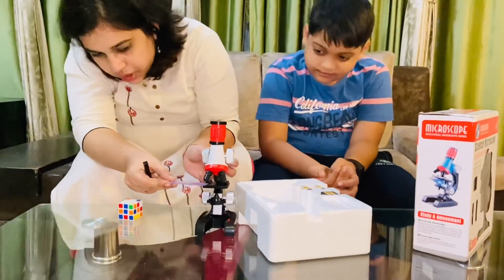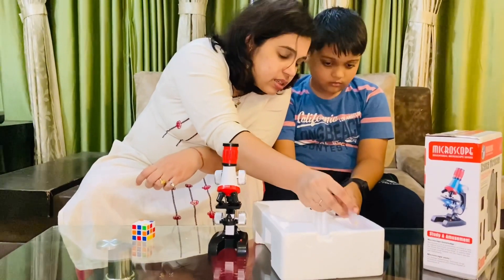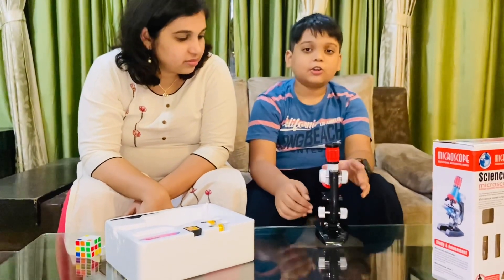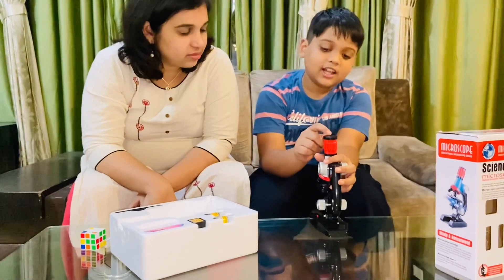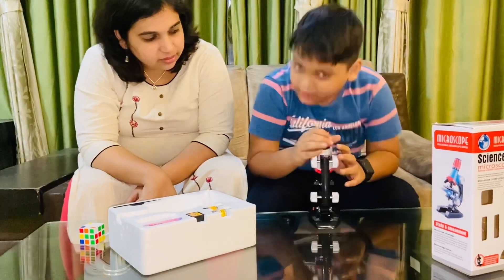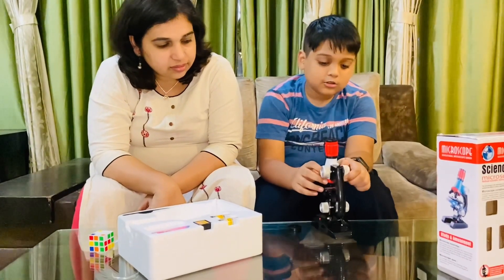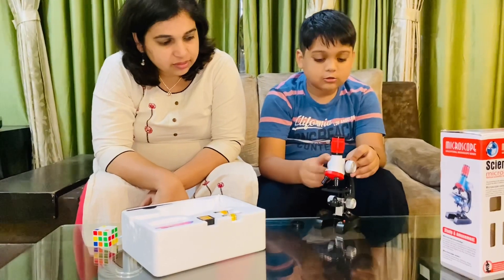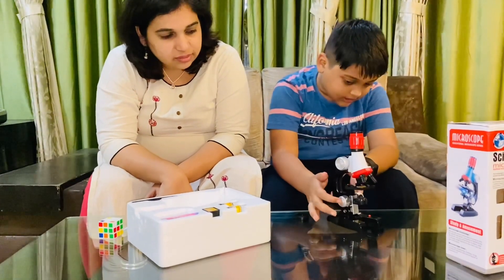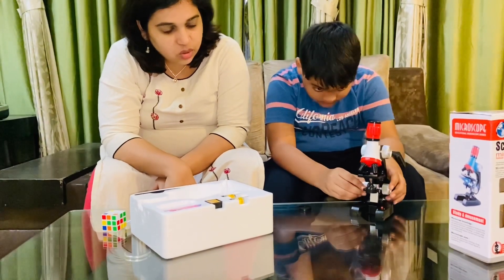Now let me explain the parts of the microscope. Starting at the top, there is the lens, which has a cover on it that you need to remove to see through. Next is the adjuster for the height — this is used to adjust the height of the microscope.